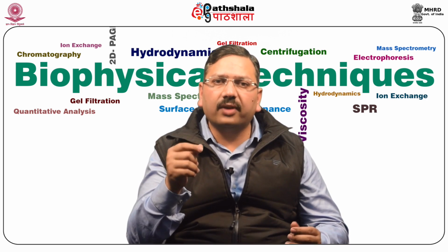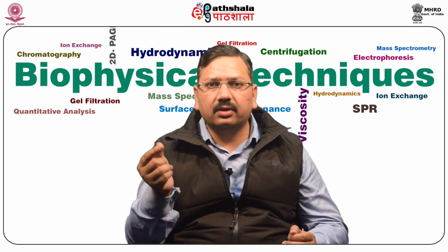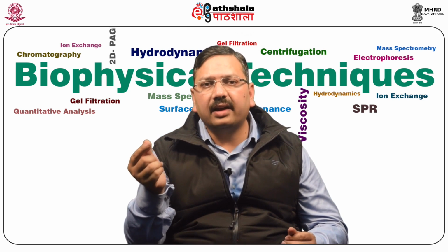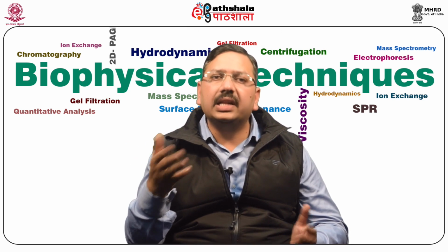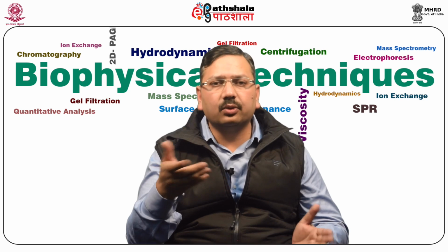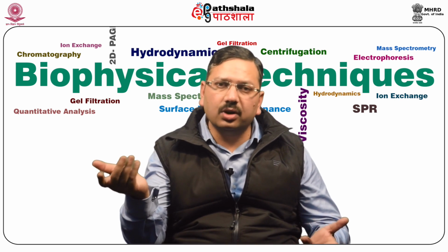While if a sample has functional groups that readily lose a proton, such as carboxylic acids and hydroxyls found in nucleic acids and sugars, then negative ion detection is utilized, and it is utilized for DNA as well as sugars.